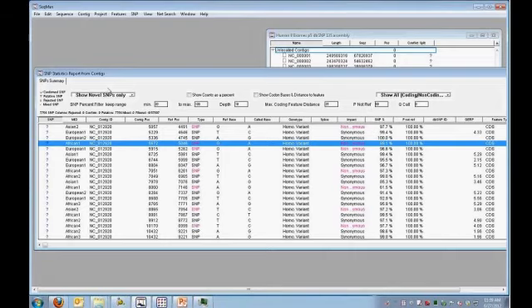And I did apply some of the filters ahead of time. When I first opened this report, there was something like 400 million possible SNPs. And so I filtered it down by applying some minimal thresholding here. So a couple things that I did is minimum percentages. Only show me SNPs that occur between 20 and 100%. The depth of 10, so only variants occurring where I have a coverage of 10 or more. And I'm also only showing SNPs that are within 25 base pairs of a coding feature, and then I increased the probability to 90 from the default of 50. And so these are user settings, you can change these.